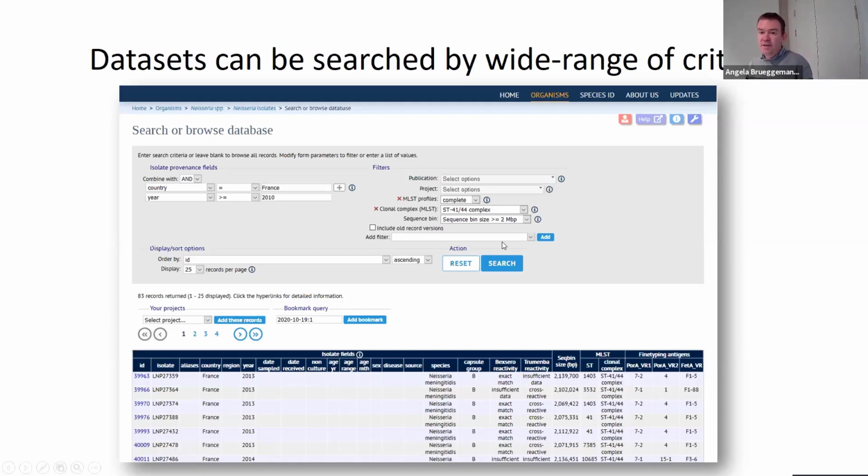So you can just, from the drop-down list, choose any field in the database and add it into the list of filters, and then that gives you a drop-down list of values for that filter, which allow you to do a quick query based on that value. And however you customize it will be remembered the next time you go into the system. So you can build up complex queries based on any attribute within the database.